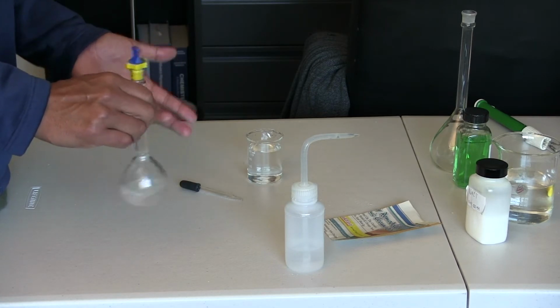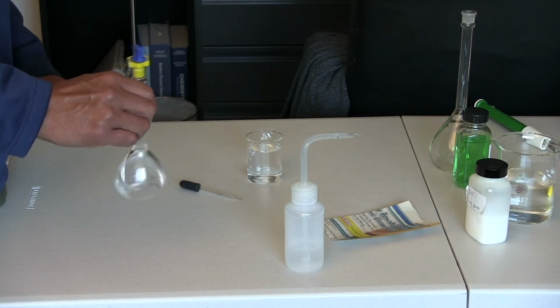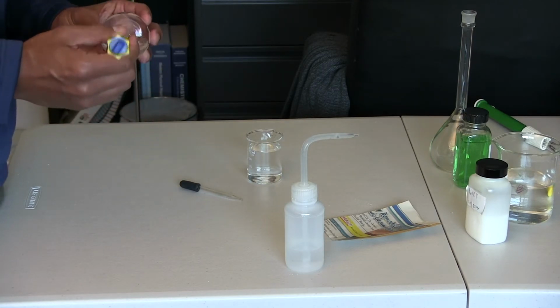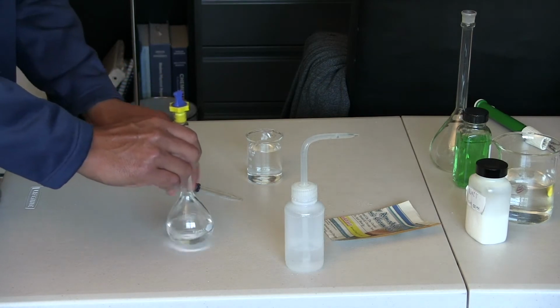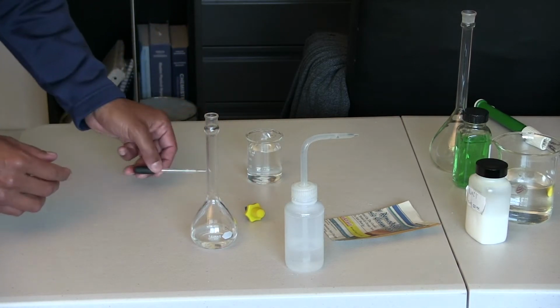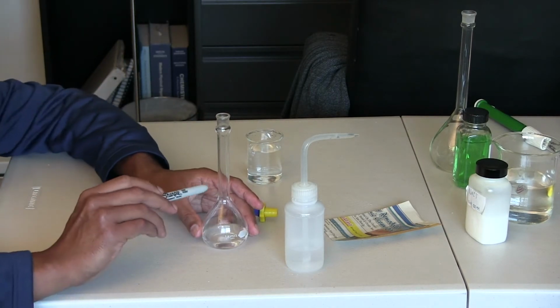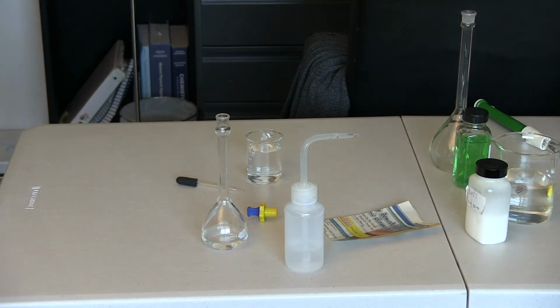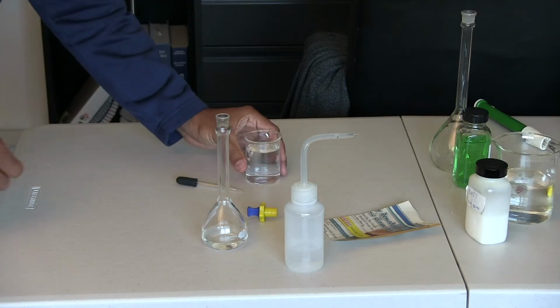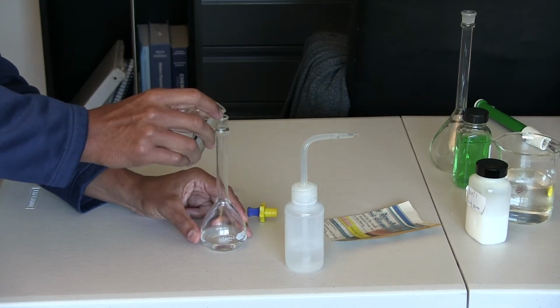So these are the steps that you would take whenever you want to prepare a solution. I've dissolved all of the salt now. So now the volumetric flask has a mark here. The mark is hard to see, but the mark is right here. And I want to add some water, but once I get close to the mark, I'm going to use my medicine dropper to add water drop by drop. So here I have some distilled water in the beaker, and I'm going to add some water to it.